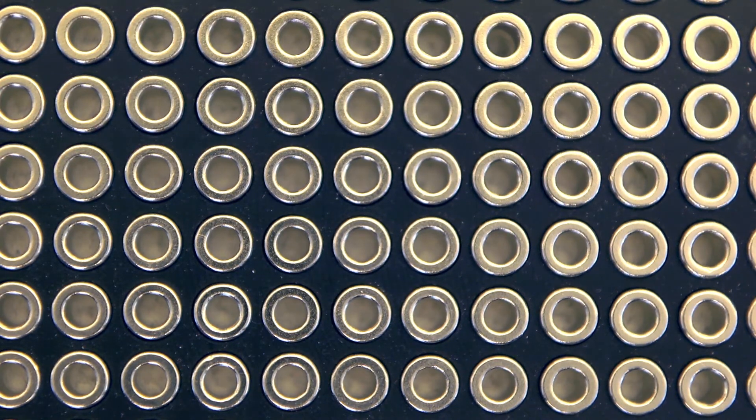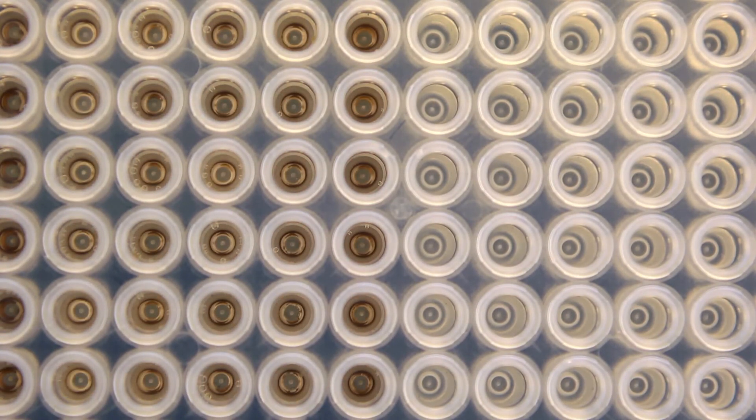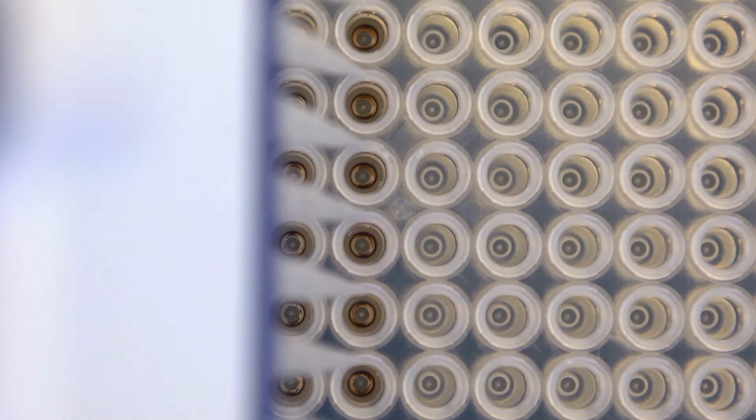Magnetic beads are added to the sample and the mixture is placed on a magnet which pulls the beads and the bound DNA to the sides of the well so that the reagents and other fragments can be washed away, leaving the relevant DNA behind.